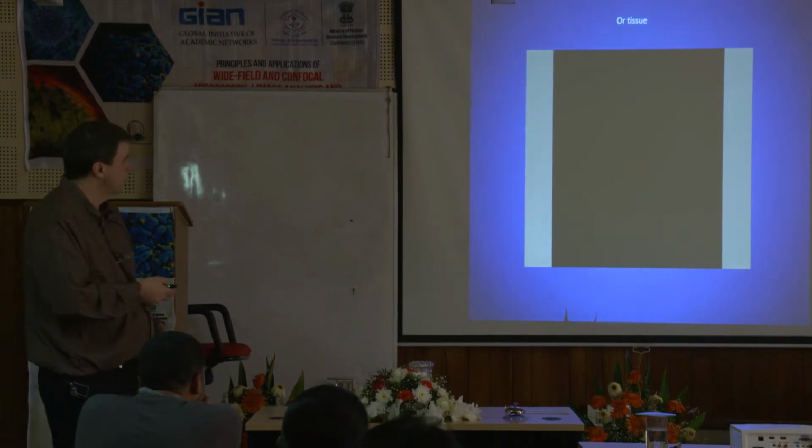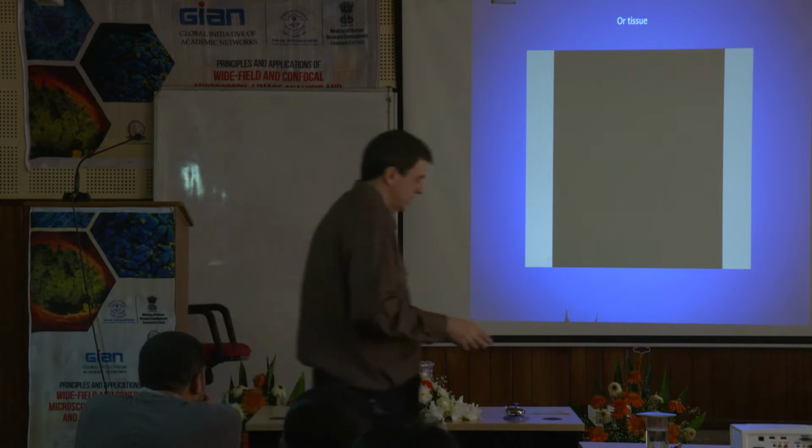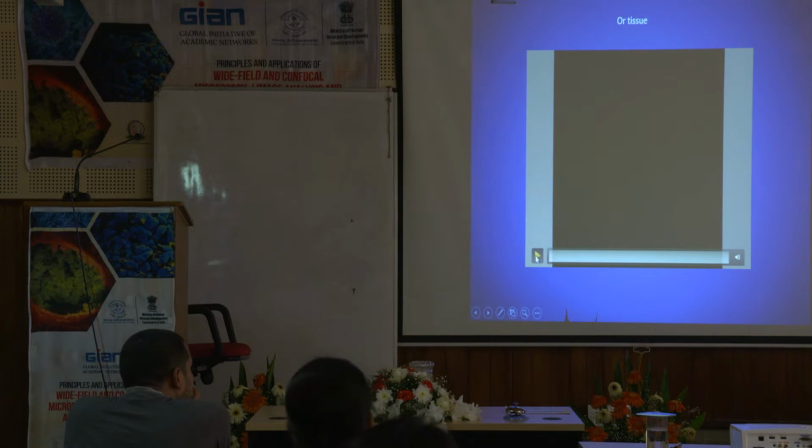Okay, so we've been talking about cells. We can do it in cells, but we can also do the confocal in tissue. Now, this is my favorite tissue I work with all the time, which is retina in the eye. I took these pictures on the confocal. So what we're going to do here is look at blood vessels in the retina.